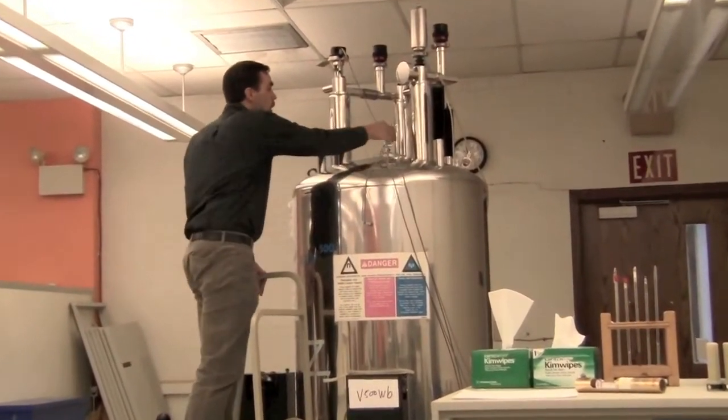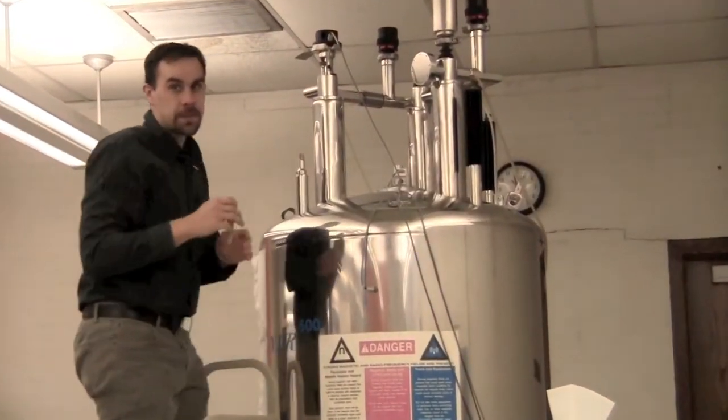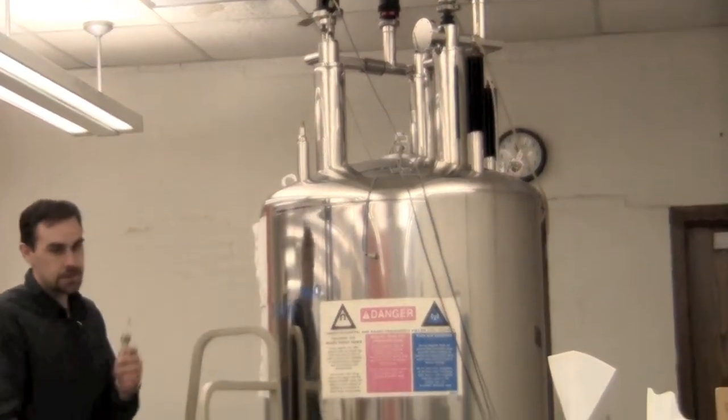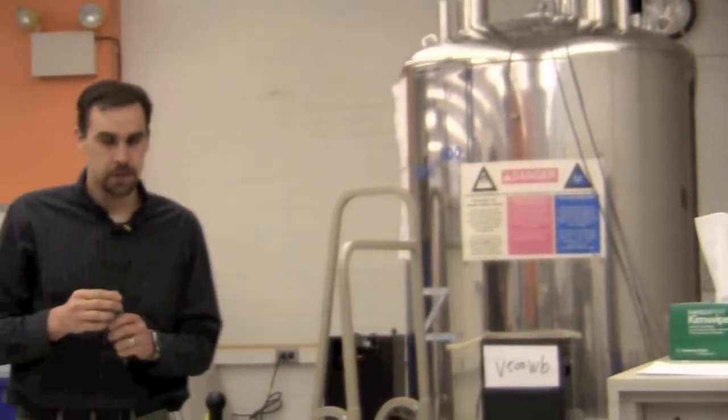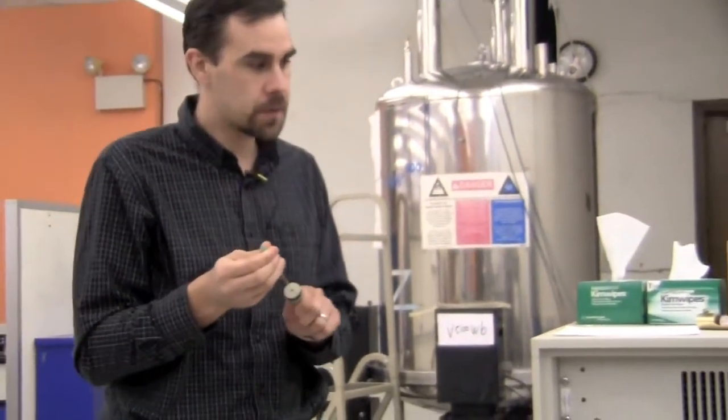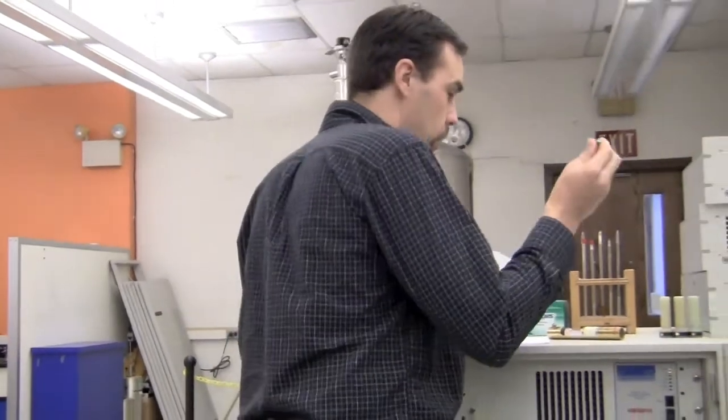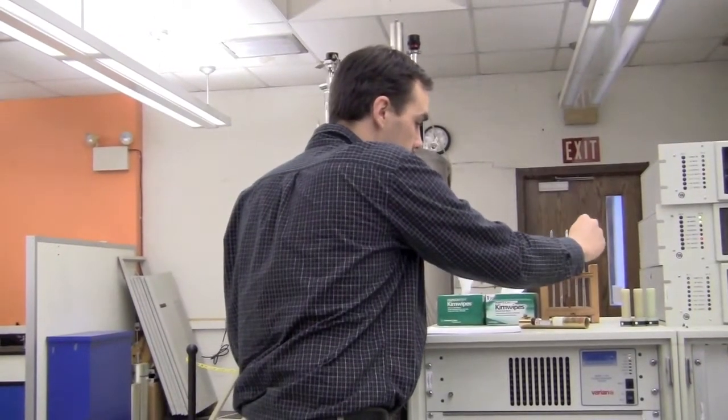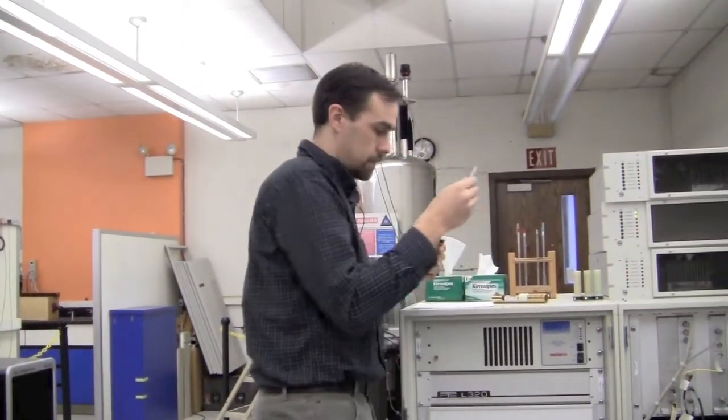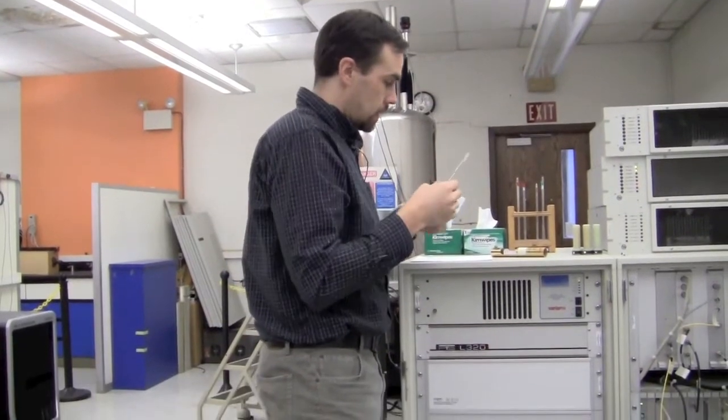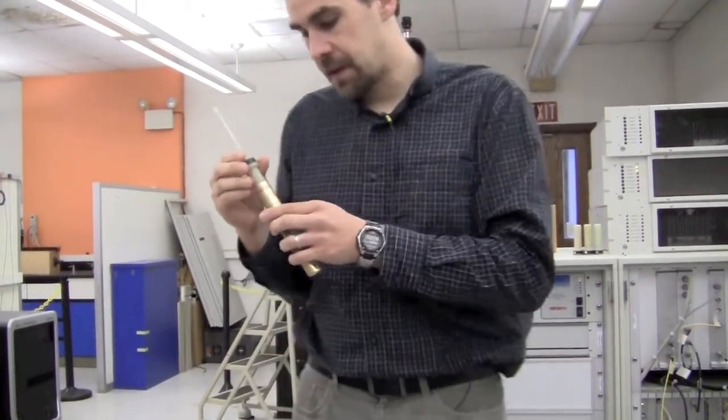Just like on all the walk-up instruments, we always keep a dummy sample in the magnet. This is the tube of D2O. This helps avoid trying to put two samples in the magnet. You can put the dummy sample in the rack and get your sample and put it into the depth gauge.